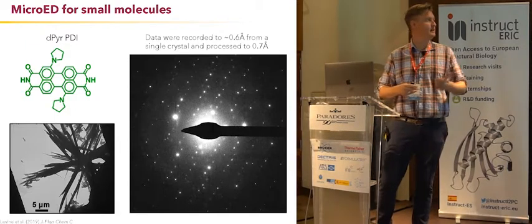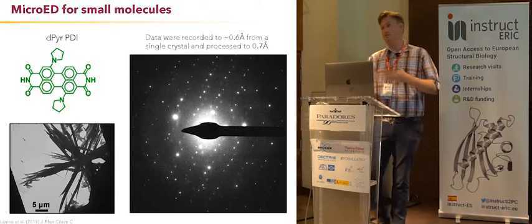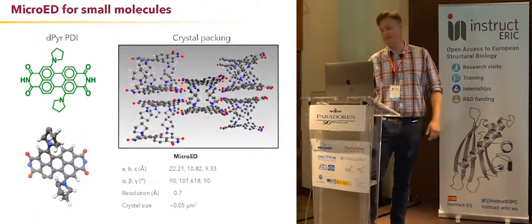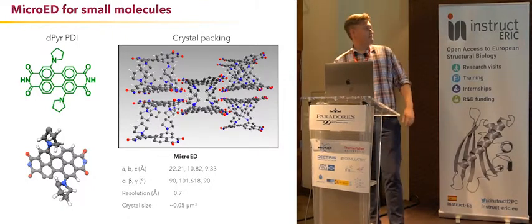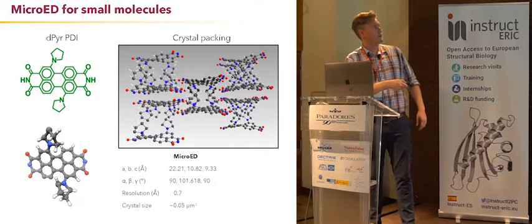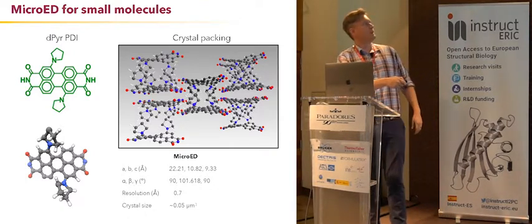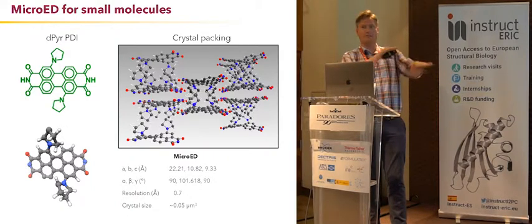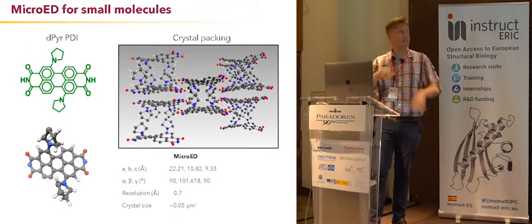We feed this into XDS, process the data in XDS, and then use the SHELX suite to solve the structure. After we put this into SHELXT, we get something that looks like this. This is the molecule, which looks very similar to what they thought it should look like. What they're really interested in though is the crystal packing. What was interesting to them was that all these five-membered rings are stacked on top of each other. They thought there'd be a lot more pi stacking, and they were finding out that it's really not. They're shifted a little bit.